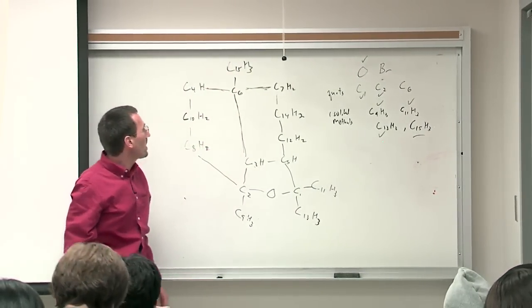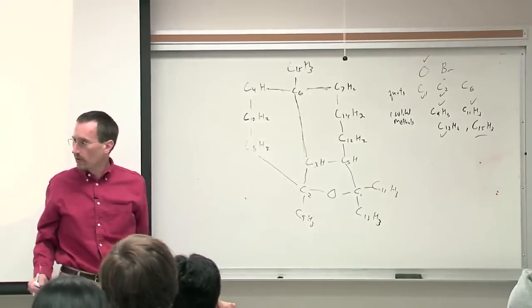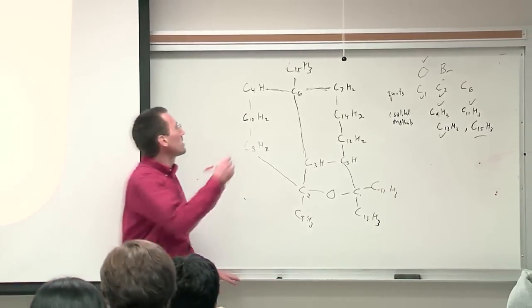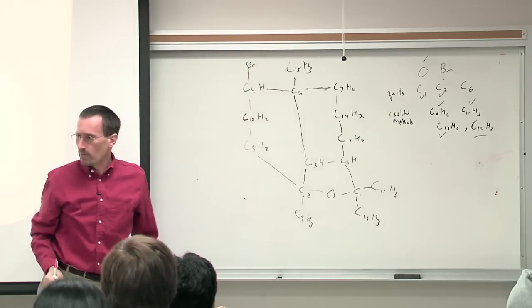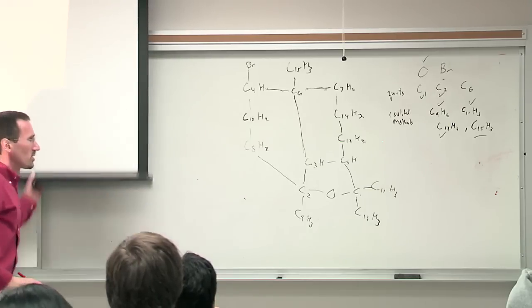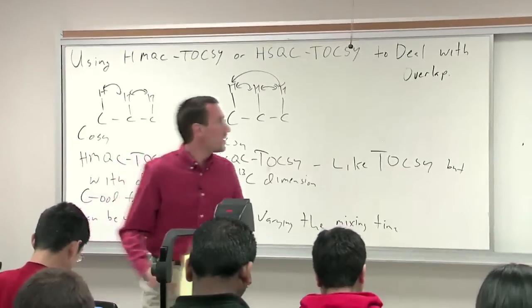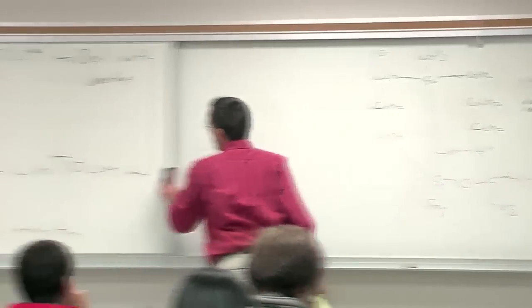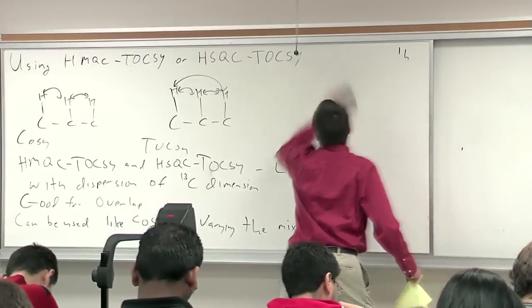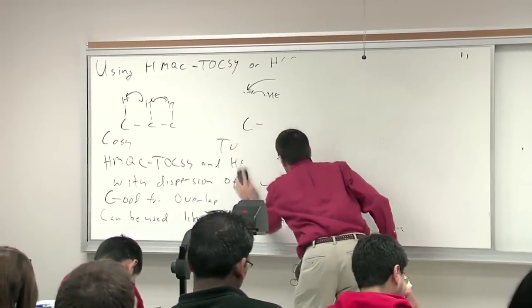And at this point, we have precisely one valence left in the molecule. We filled all of our valencies. And so our remaining valence is over here and is our bromine, which explains why that carbon is a little bit on the downfield side. So at this point, let's return to our bromomaleol structure. Deal with what's happened here.